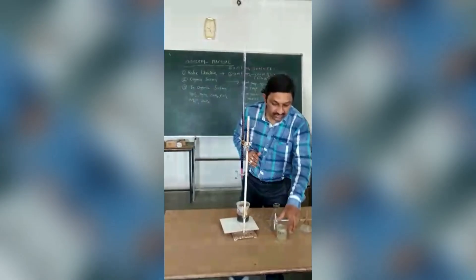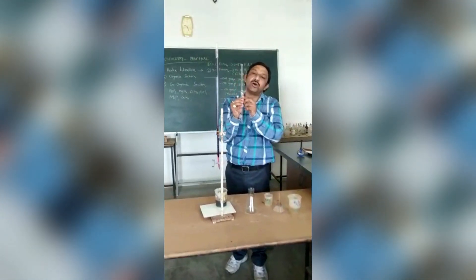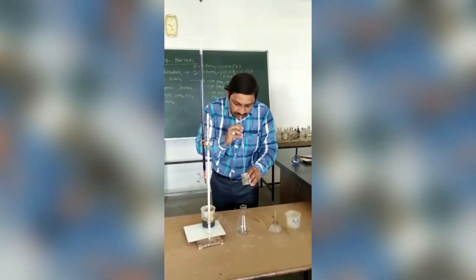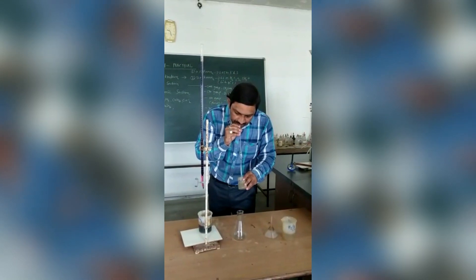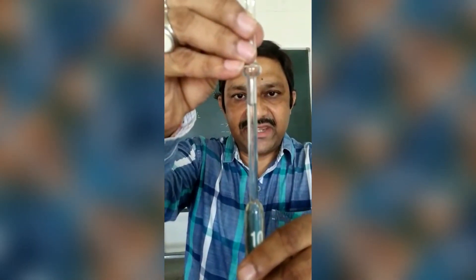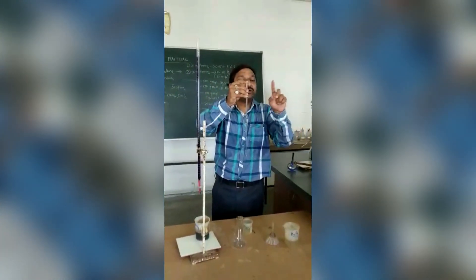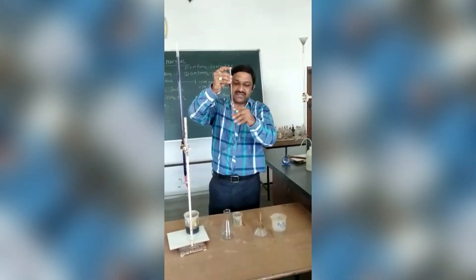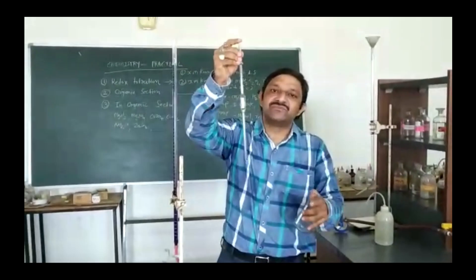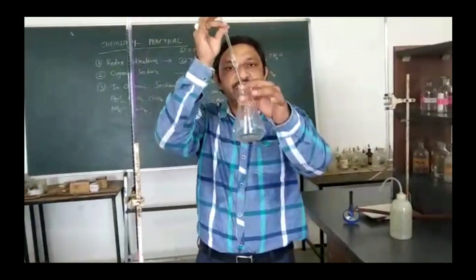Your next step is ferrous ammonium sulphate. You have to take 10 ml ferrous ammonium sulphate through your pipette. Here is your 10 ml pipette. In this case you have to choose the lower meniscus for ferrous ammonium sulphate. Now I am taking ferrous ammonium sulphate solution into my conical flask.